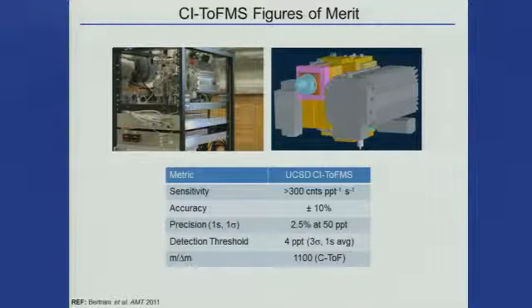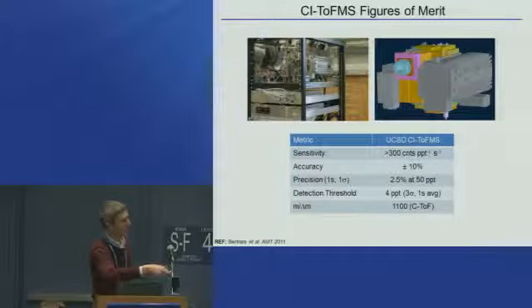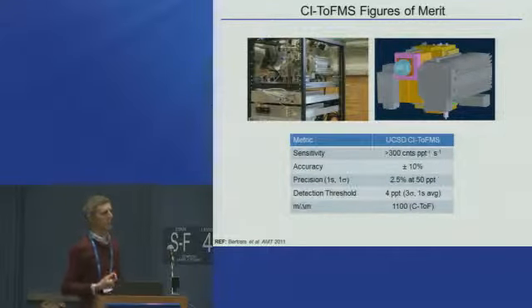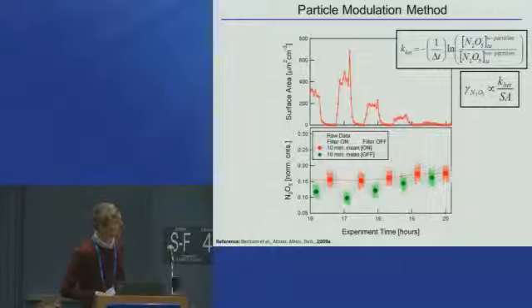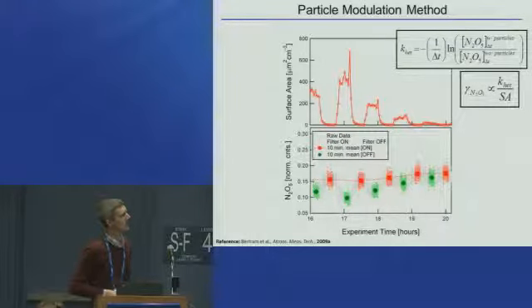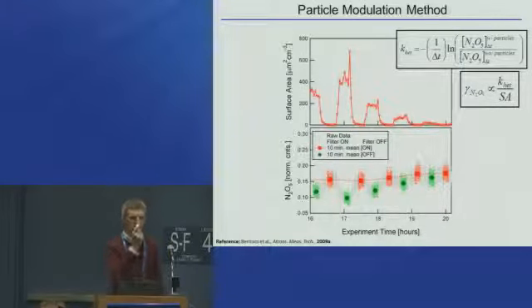So what are the end products of this? It actually becomes important to have a very sensitive instrument and a reasonably accurate instrument. This is not a high-resolution instrument, but it allows us to do this reaction under ambient conditions, and that's important for interpreting these results.